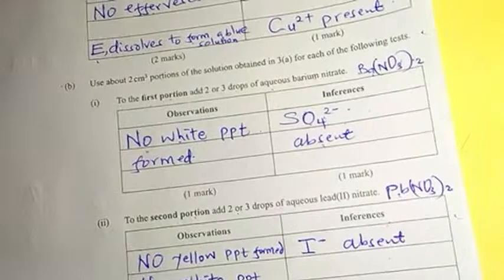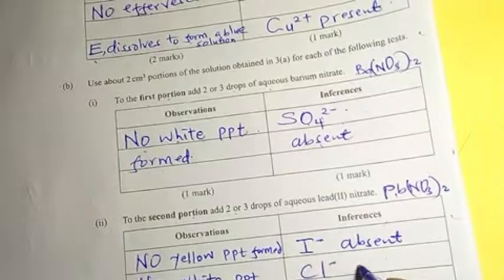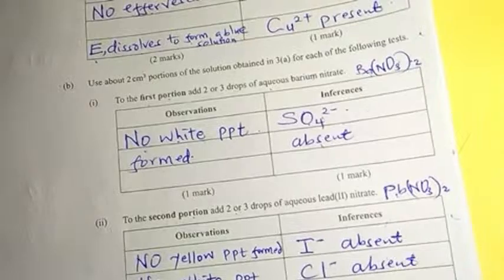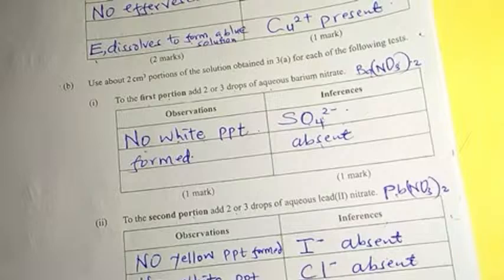Now, if there is no white precipitate formed, then we say there is no chloride ion. Chloride ions were absent. Sometimes you can even say bromide ion, because bromide ions also form a white precipitate with lead. These two ions were absent.